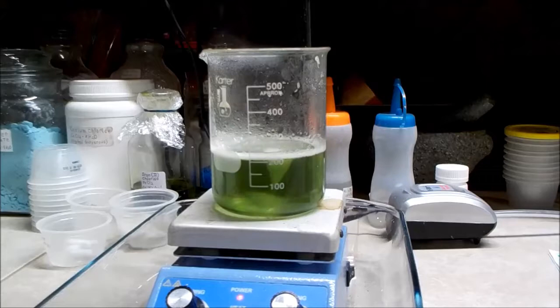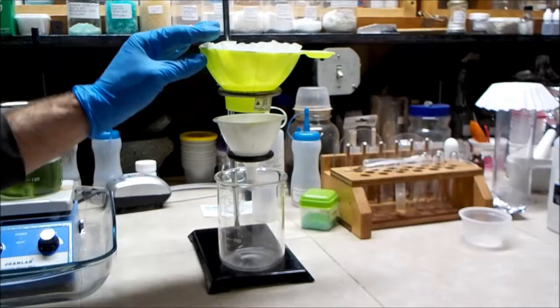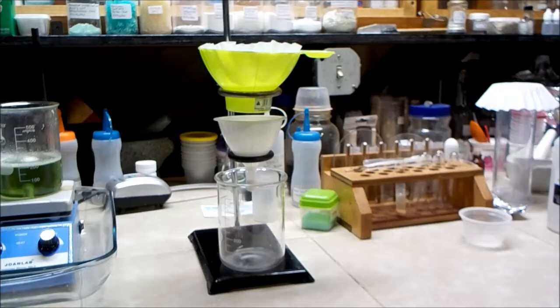So it looks like everything is dissolved. So now I can go ahead and do the filtration step. So the setup I have here is a coffee filter on top, and then below that another funnel with cotton in the neck. So I'll do a double two-stage filtration in an attempt to save some time.